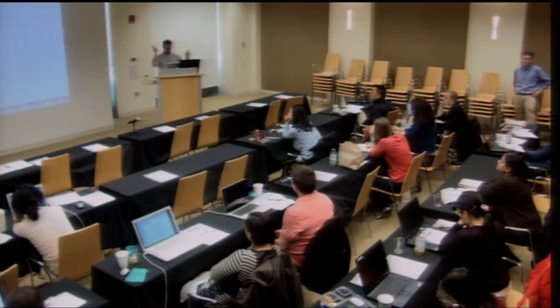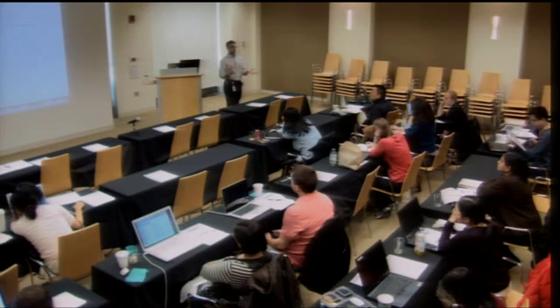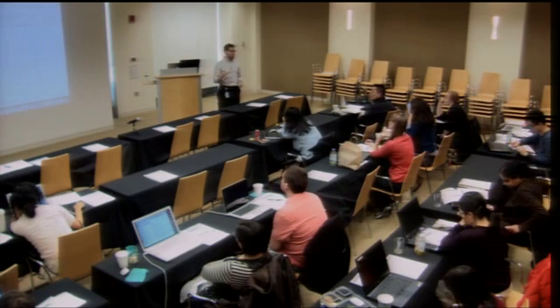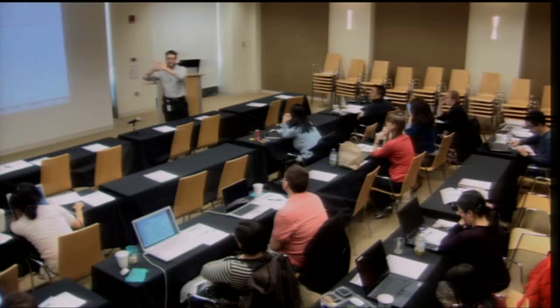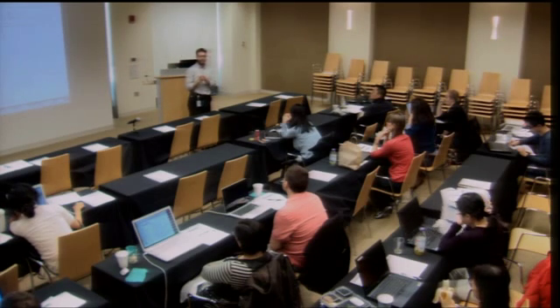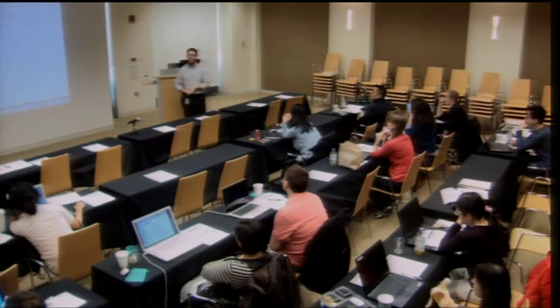Okay, so if this is all you wanted to do, then you could generate your hit list from this. But one question, and I'm not saying you need to go further than this. I mean, if you did a particular screen and you see genes, then you're done. Okay, here's your hit list. Go. I will say that people sometimes spend far too long agonizing over their hit list. They want to analyze it every which way to Sunday.